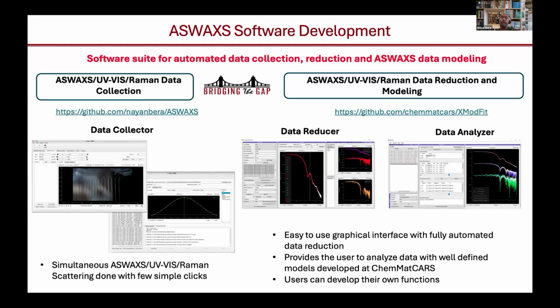At the same time, some of the users have already used XModFit, not only in ASAXS but also in the liquid surface community, which gives you a sense of how a sample can be analyzed in a meaningful way to get the information out. These are very easy-to-use software packages developed in Python and are available from our GitHub account, as mentioned here in the slide.